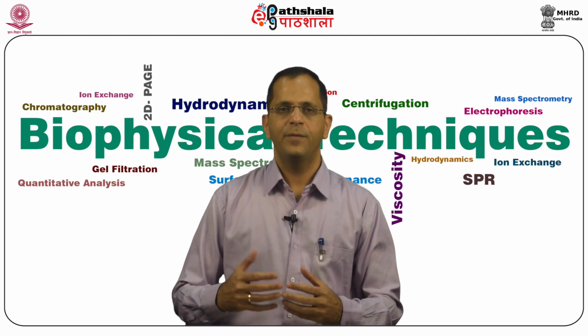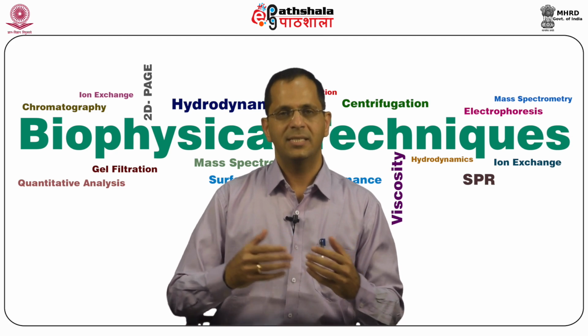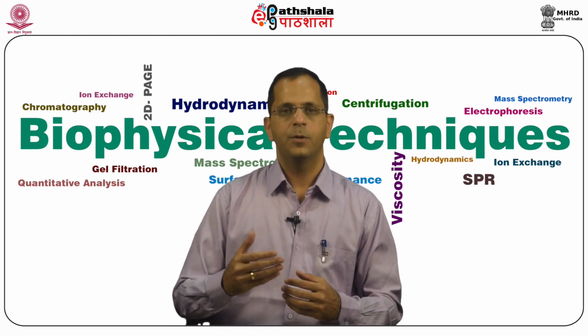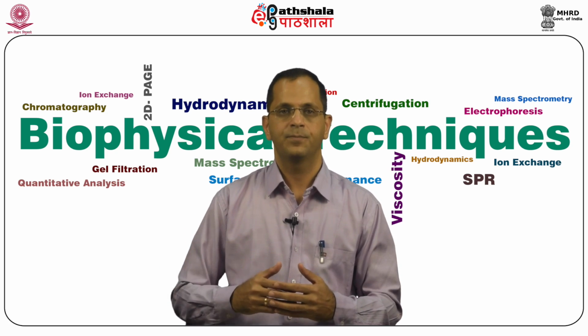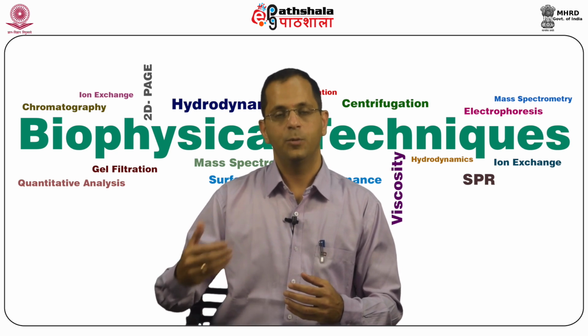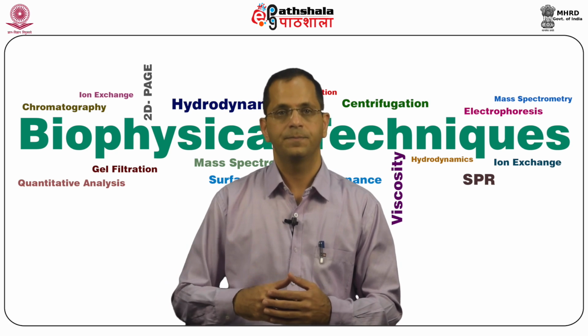So, even before we start, let us try to understand how proteomics is relevant from a clinical perspective. You could be doing biomarker discovery, that is, for the diagnosis of a disease. You could be identifying a new drug target for which you would be developing certain ligands or drug molecules.